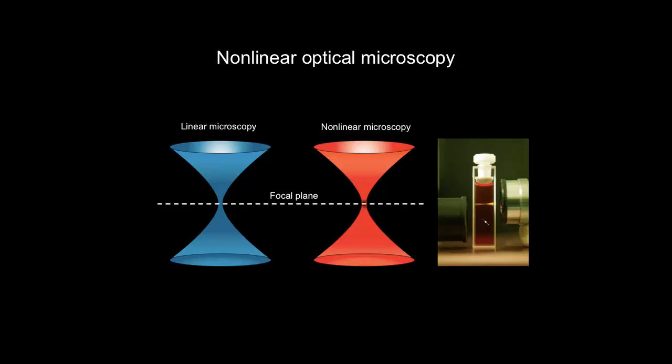I just wanted to make sure that we understand the benefits of the nonlinear when compared with linear. I don't mean to disrupt the flow of the talk. If you're going to get to that, that's fine. So right now, to clarify, you're just showing that with a nonlinear signal you have the opportunity to stimulate it at the focal point, to only generate light at the focal volume without generating light outside the focal volume. Yes. That's the point she's trying to make now, and how that comes about she'll discuss in just a second.